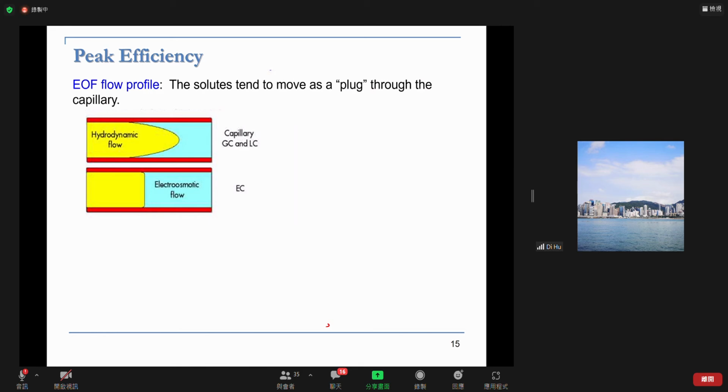So it's the capillary format actually used in CE, and it has its own advantage. It has a reason to use that kind of capillary column, because it can minimize many sources of the band broadening that occur in conventional HPLC.